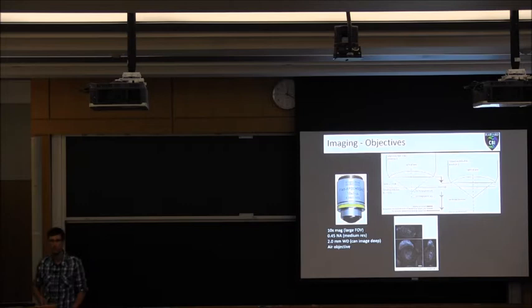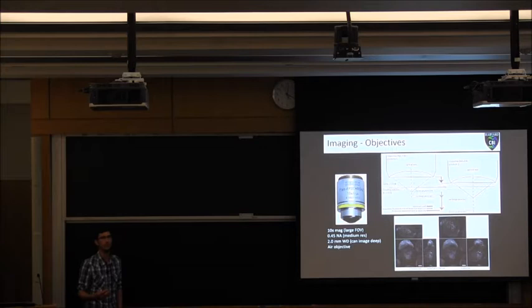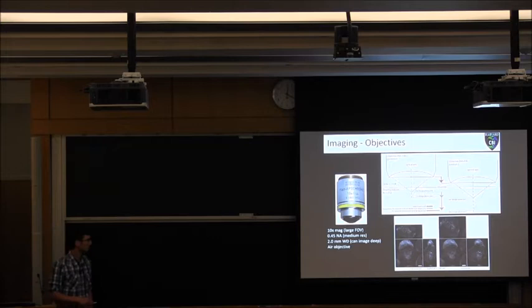Right. So we can actually apply a correction to that data, and if we apply the proper correction, now it stretches that data back out, and you can see we actually have a sphere there and not a squid. So that's one of the big things to watch out for when you're imaging with an air objective. And it's very obvious in this situation. I think these guys are about 500 microns, maybe a little bit more in size.